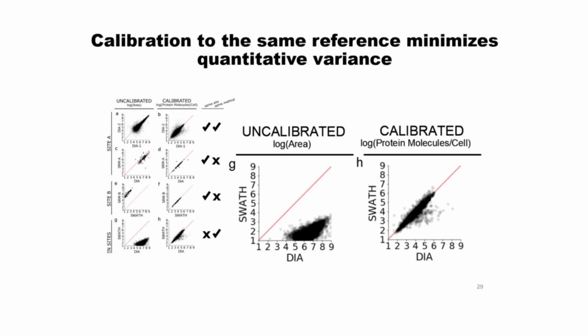We were shocked actually that it worked as well as it did, and our assumption was just that we're not using the exact same reference. That became an argument for us why we should be using the exact same reference. Yep. So basically you're saying that if, for example, you and the lab in Zurich happen to have the same spike, you wouldn't need anything with known absolute amount at all.